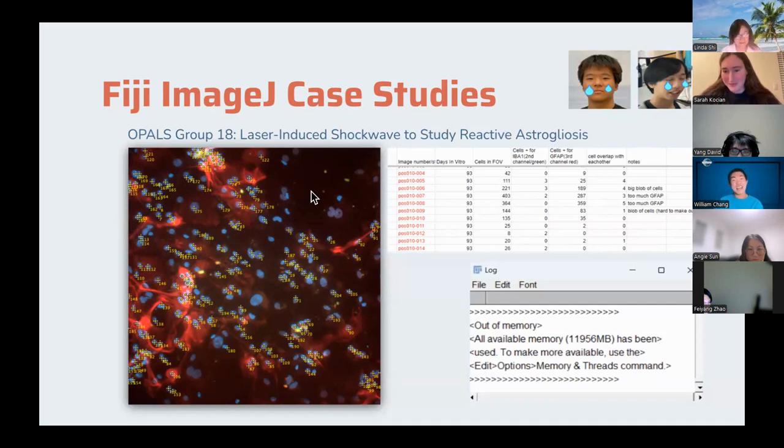But the central message behind this, I guess, is that image processing is and will be a difficult task, both manually and conceptually, as you try to also develop a computer program to help you quantify cells or do whatever tasks your project has you do.